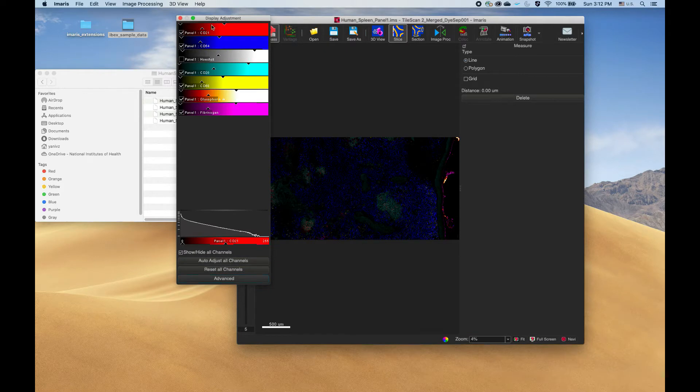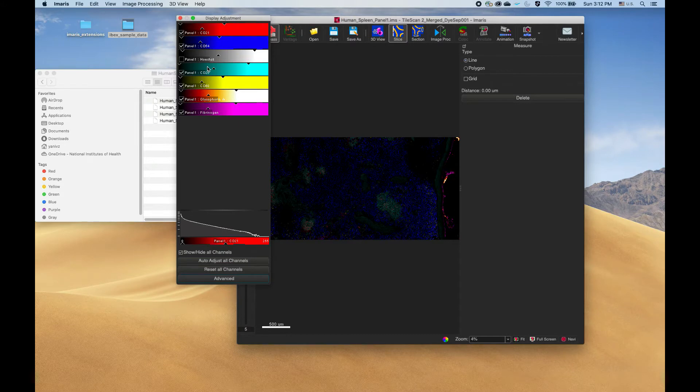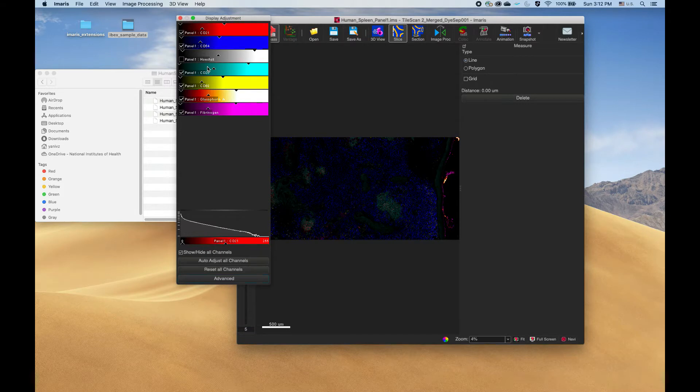What there is a requirement is on the channel names. The channel that we use for registration has to have the same name across all panels. That's how we identify corresponding channels.